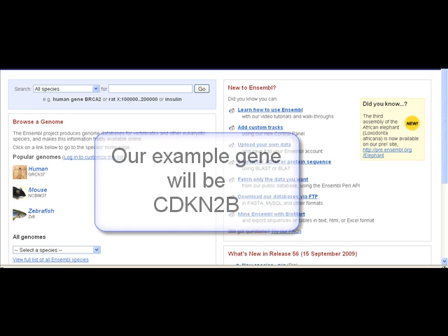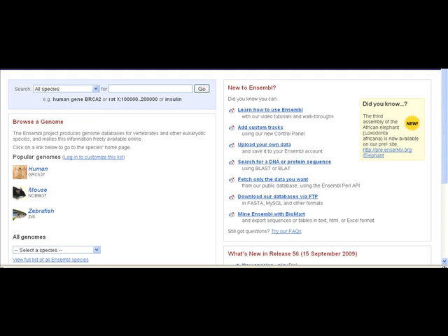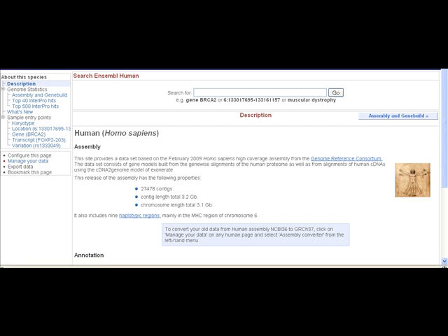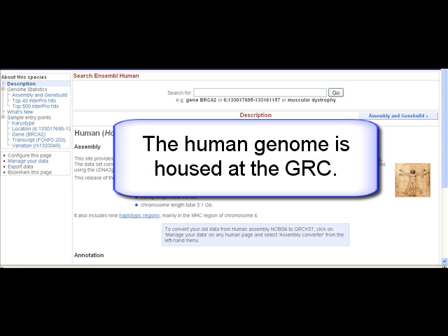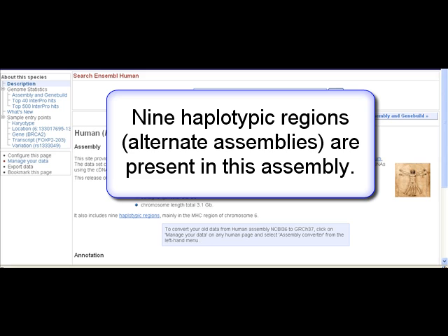We could search directly from the main page by typing in 'human CDKN2B gene' or simply just 'CDKN2B'. However, let's click on Homo sapiens to move to the species-specific homepage for human. Here we find information about the assembly used and any alternate sequences for haplotypic regions. For example, for human, nine alternate assemblies are included.